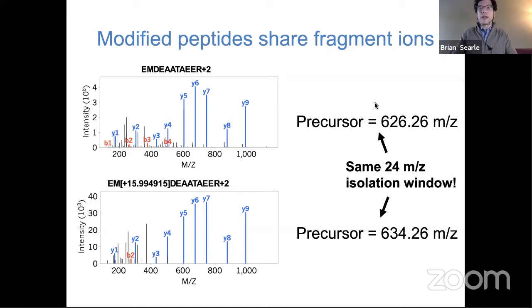And this is particularly an issue with lots of types of these experiments, not just wide window fixed isolation experiments. Even if you use variable width windows, there are regions at the high m/z range where you actually have very wide isolation windows. But if you look at the fragment ion traces for these, so these are again the integrated fragment ions for these DIA experiments, we actually see basically all of the same types of fragment ions except for a handful of B ions.